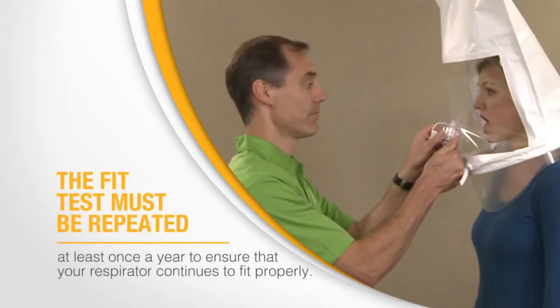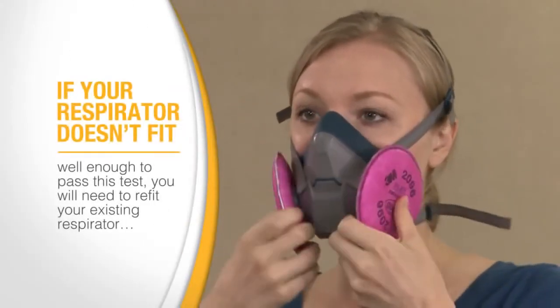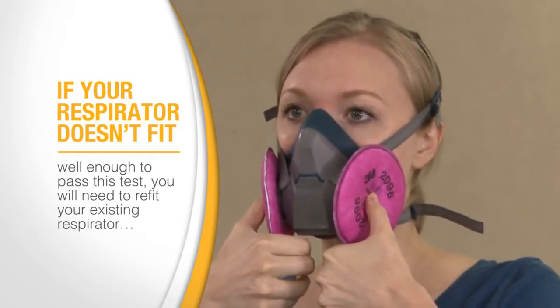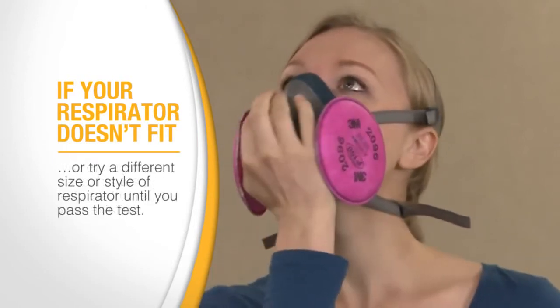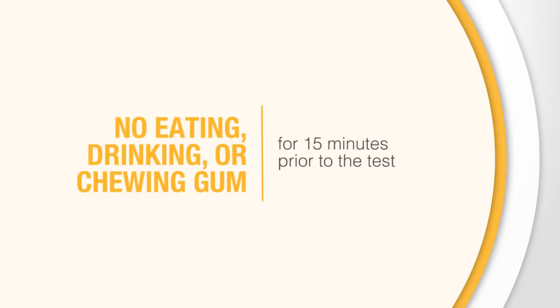The qualitative fit test must be repeated at least once a year to ensure that your respirator continues to fit properly. If your respirator doesn't fit well enough to pass this test, you will need to refit your existing respirator or try a different size or style of respirator until you pass the test. Because this is a taste test, you cannot eat, drink, or chew gum for 15 minutes before the test.